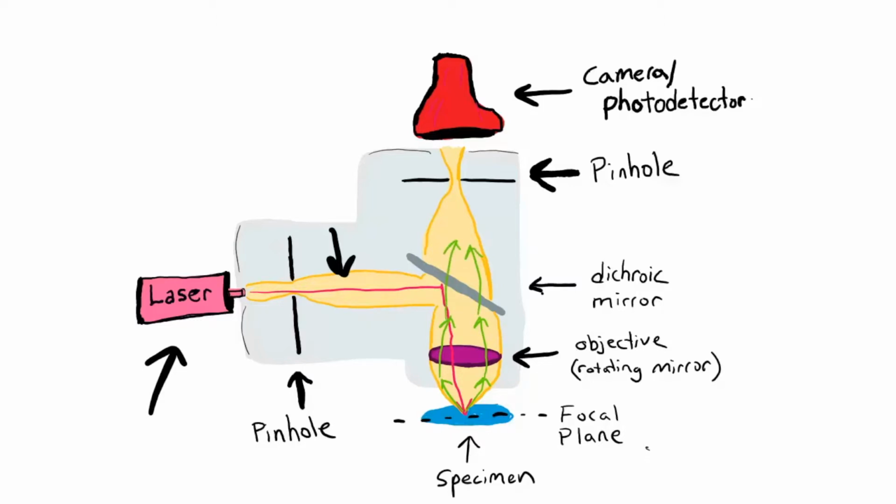The next stop is the pinhole. The pinhole in front of the detector will block the out-of-focus light, not allowing it to be captured on camera. The light passing through the pinhole will reach the detector, which will capture a single image. This process will be repeated several times while changing the direction of the rotating mirrors to take different images in different angles of the specimen sample.